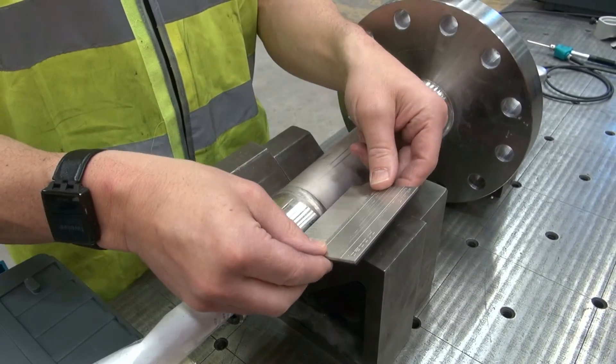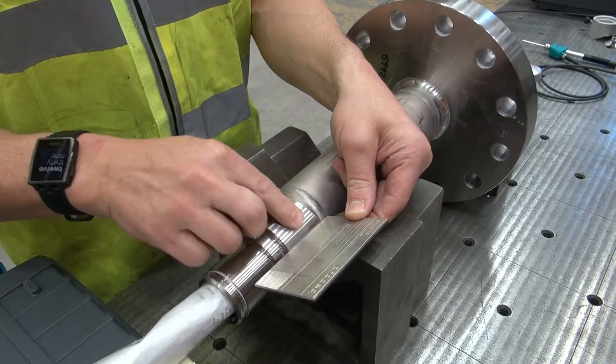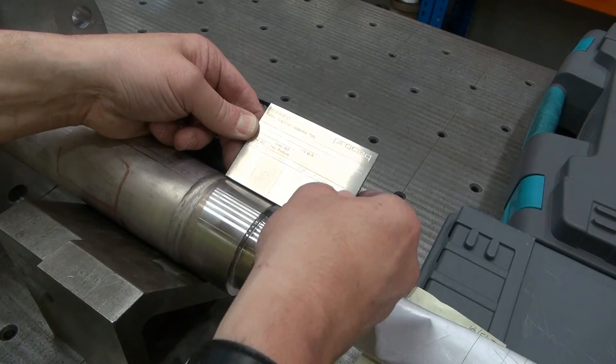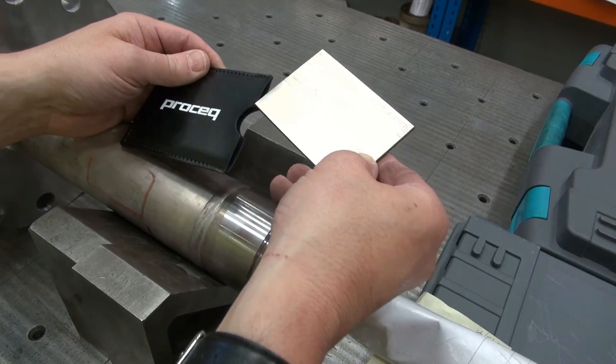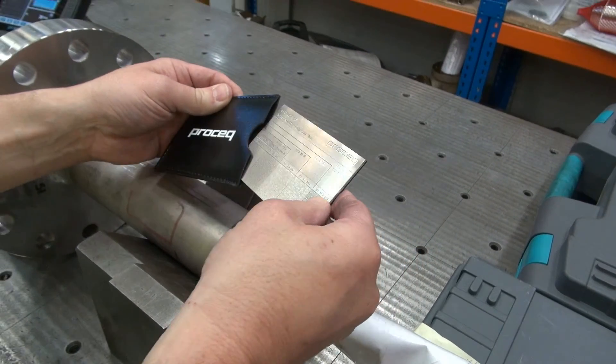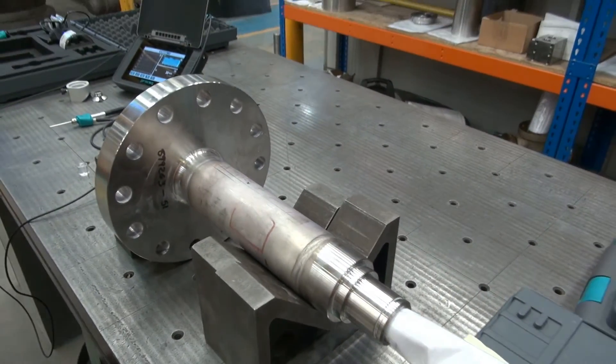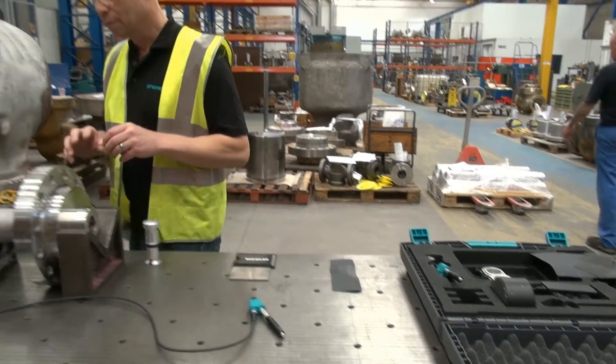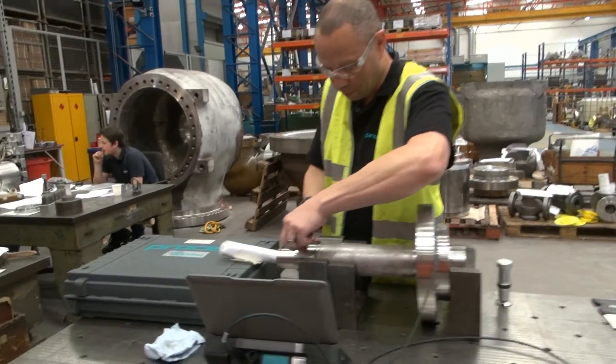Here's the surface roughness comparator plate provided to identify the conditions of your test sample to start with. The next step would be to choose the appropriate sandpaper and prepare the surface as necessary.